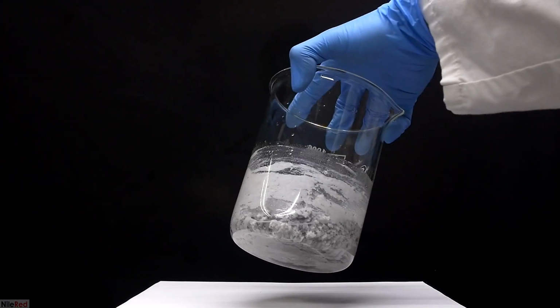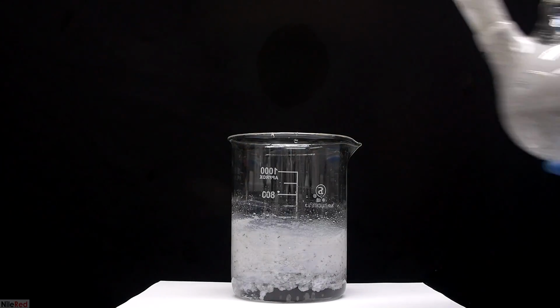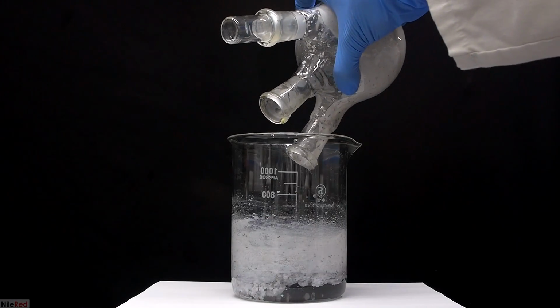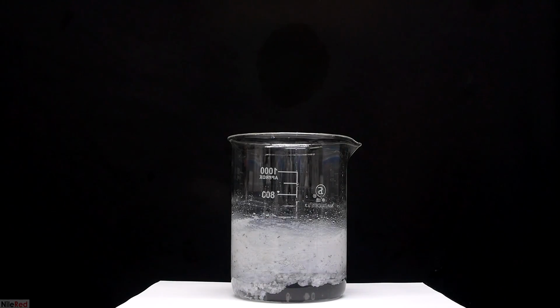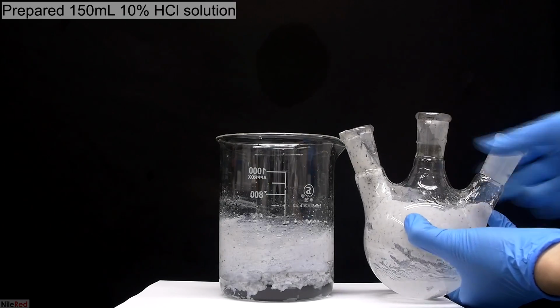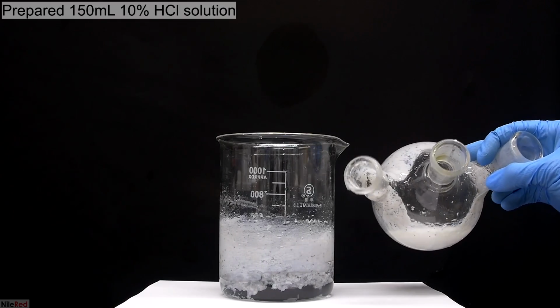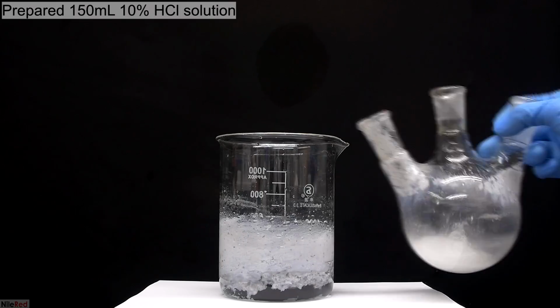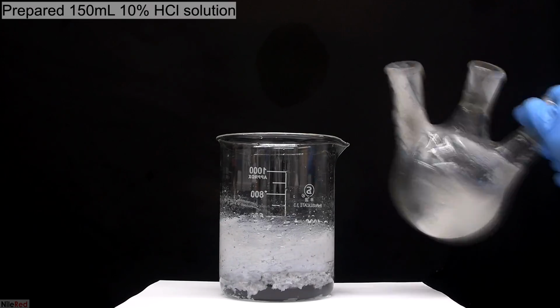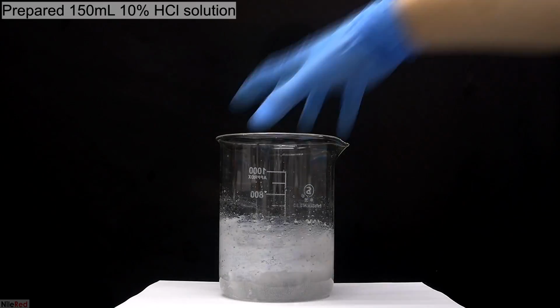This precipitate isn't soluble in either the ether or the water. I washed the reaction flask out a few more times using a little bit of water, but it seems like there's still quite a bit stuck in the flask. I prepare 150 milliliters of 10% hydrochloric acid, and I use some of it to wash the reaction flask. The 10% hydrochloric acid does a much better job washing the flask, and after washing it a few times, I completely cleaned it out.